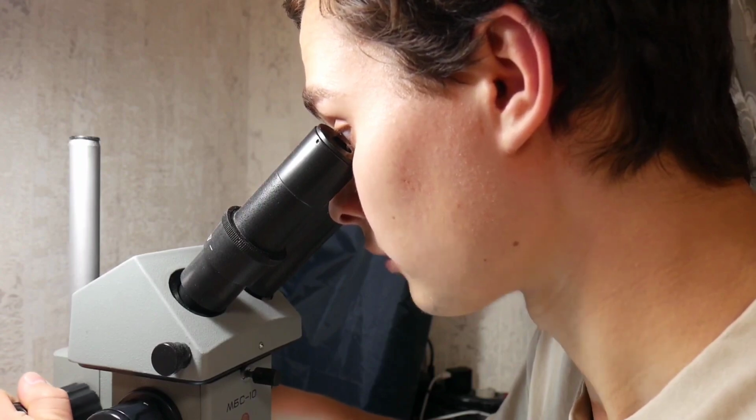And what we see under a microscope is an ant. A little one, as you can see. Its head came off quite a bit, which could have been caused by the resin. It is quite possible that initially the ant got stuck in the resin with some part of the body, and then the oncoming flow of resin from the tree simply tore it into several parts, in this case the head and the rest of the body.